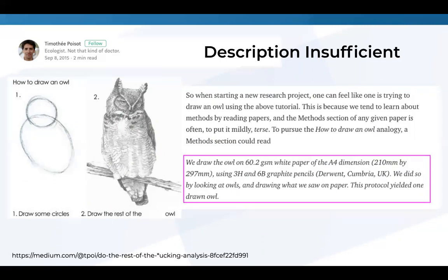just don't get all the information that is actually critical to follow the experiment, and there's a lot of things just missing. Sometimes maybe people just assume that somebody knows something, or I don't know, but there's really a lot of times not enough detail.